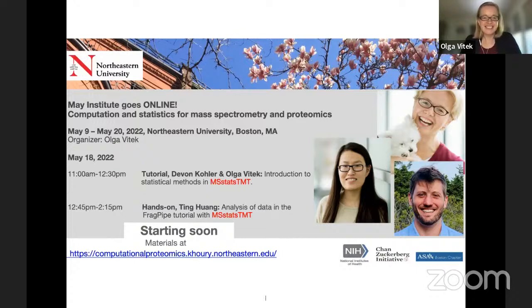for the next 3 days. Today, we are going to talk about statistical analysis in MSstats, specifically for quantitative experiments with TMT labeling. So I hope that this will be of interest to you.